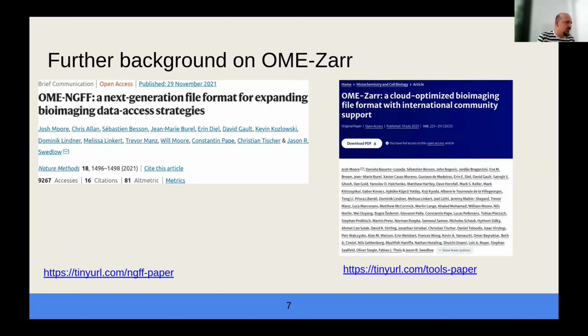And you can learn more about OME-Zarr in these publications. This is a benchmarking study comparing the access performance of OME-Zarr to some other file formats. And here you can find out more about the existing tools such as converters, viewers, and other sorts of tools.